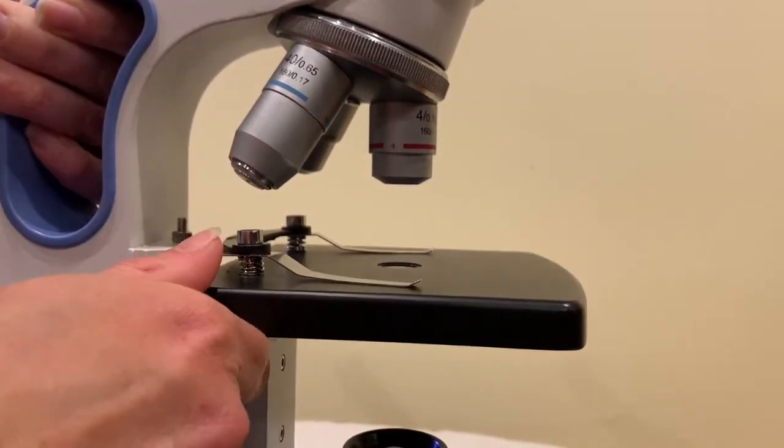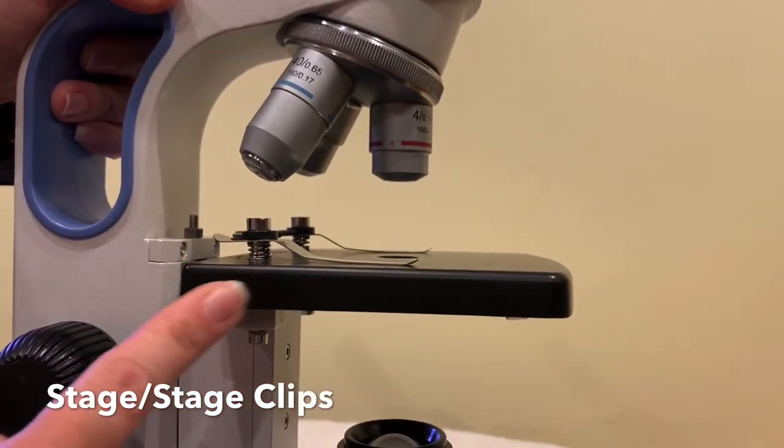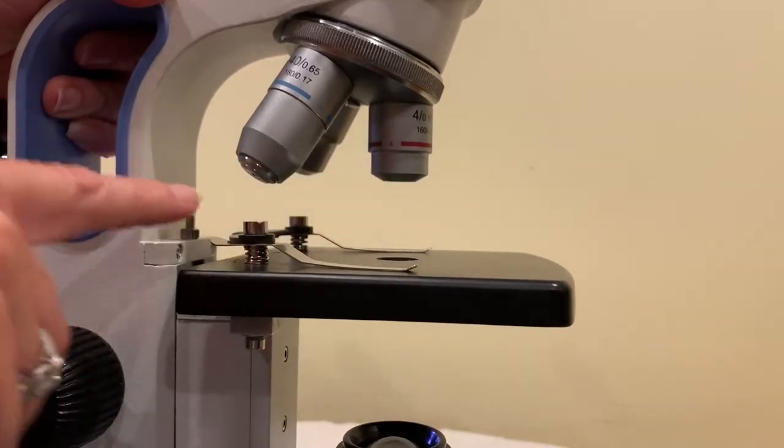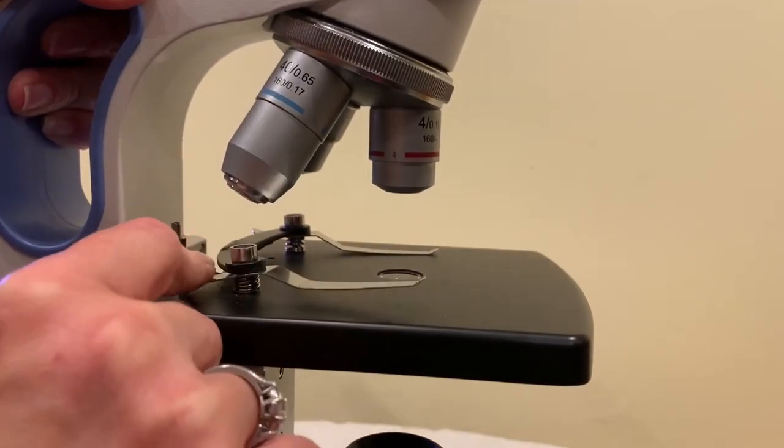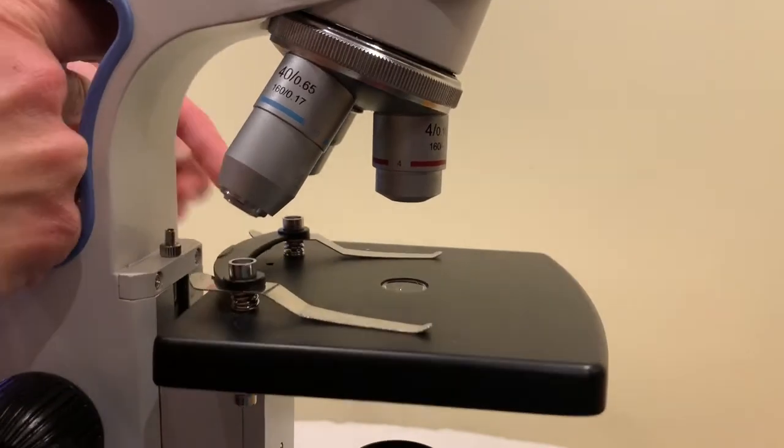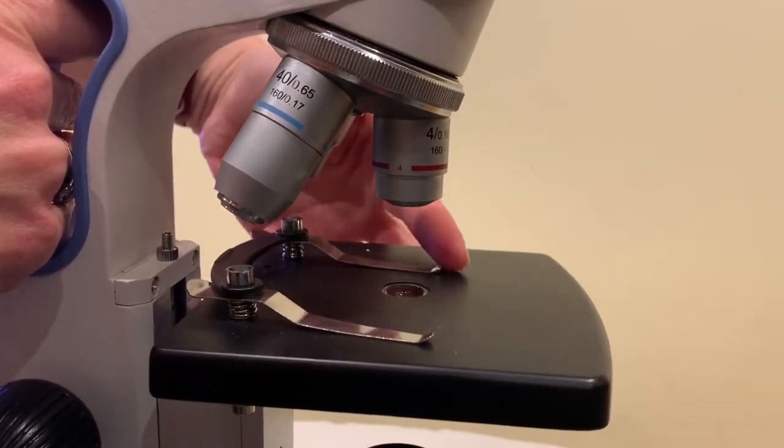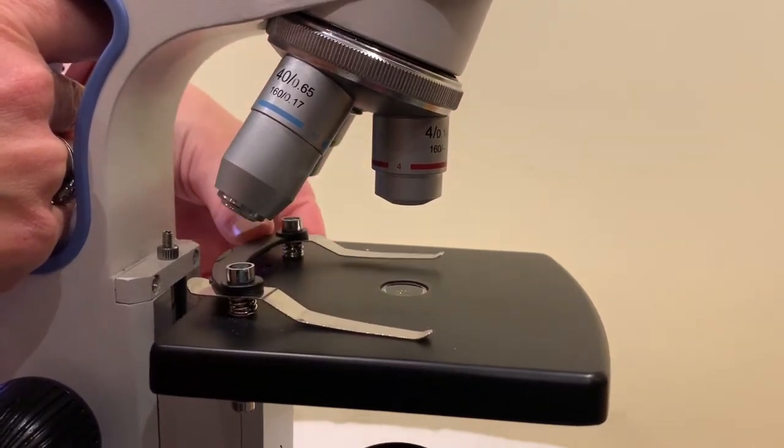Next, since we're right here, this is the stage. The stage is where we put our slide. These are stage clips. See they're just little clips and when you put your slide on the stage, which I'll show you later, the slide goes under the clips and the clips hold them in place.